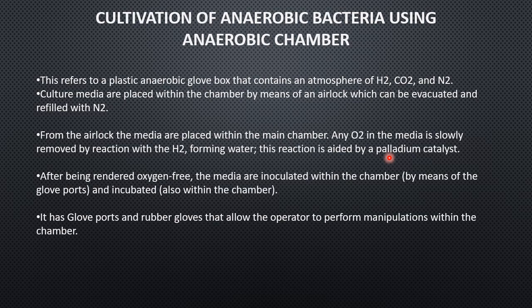Okay, so after being rendered oxygen free, the media is inoculated within the chamber by means of the glove port, and again it is incubated in the chamber itself. You cannot take your plates out of your anaerobic chamber and keep them in your regular aerobic incubators. Okay, you have to incubate anaerobic plates in an anaerobic environment, so you will be incubating them in your anaerobic chamber itself. So for working, there are two glove ports. Okay, it has glove ports and rubber gloves attached to it so that you can operate easily.